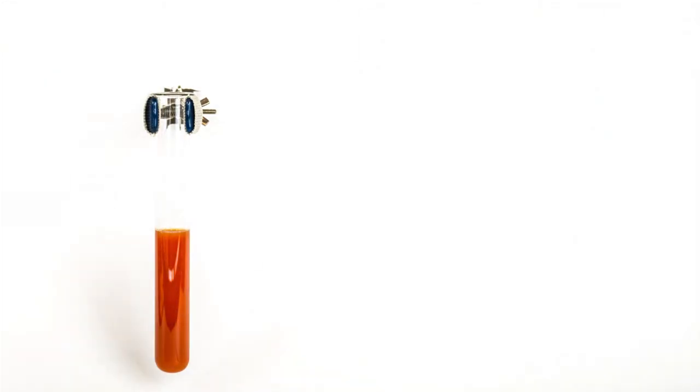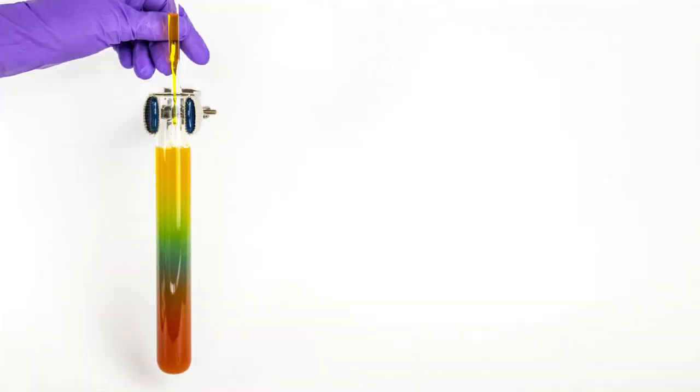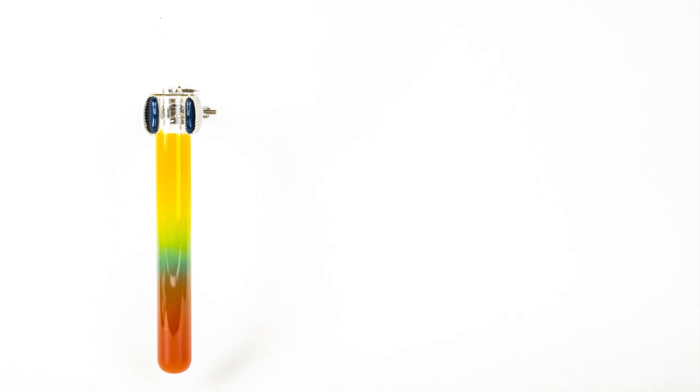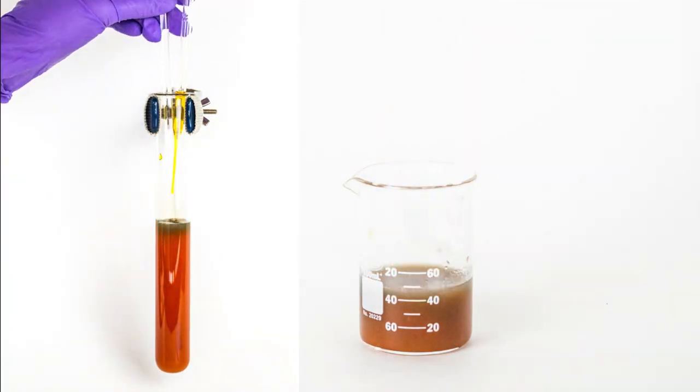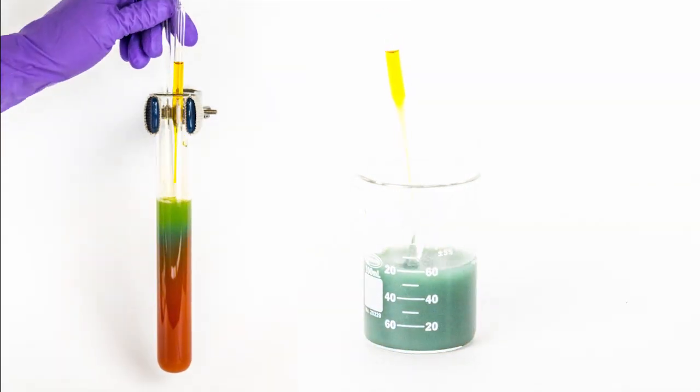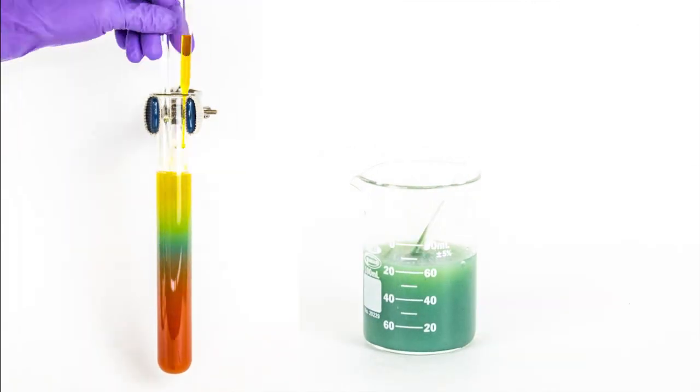Because tomato juice is so thick, it helps the reaction last much longer. The long and narrow test tube keeps the colors separated longer by maintaining a steep density gradient. If we compare it to a shallow beaker, the colors mix rapidly to look more like a tomato juice swamp.